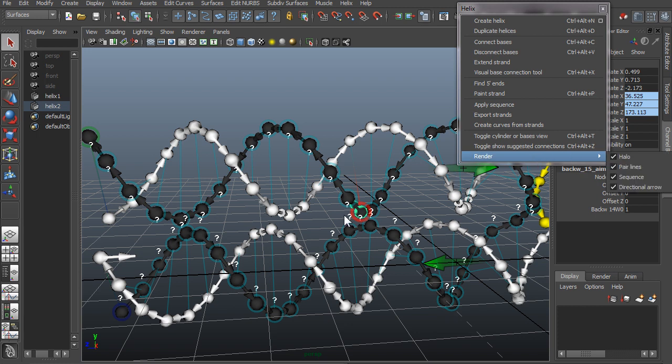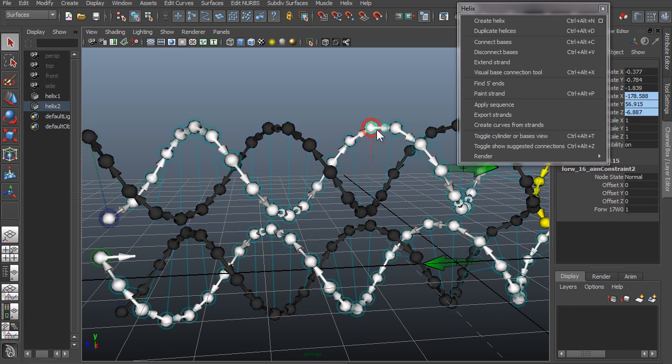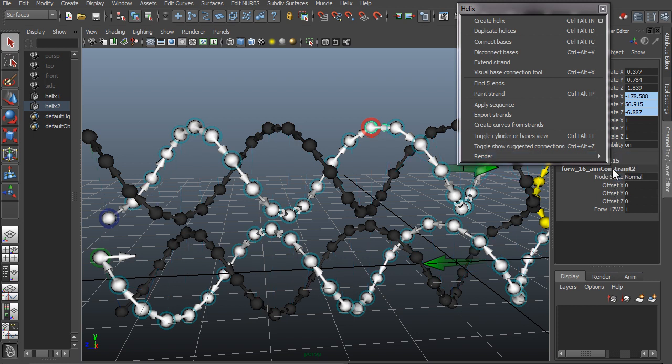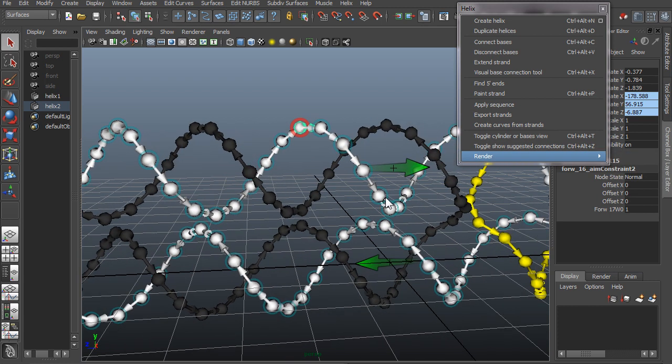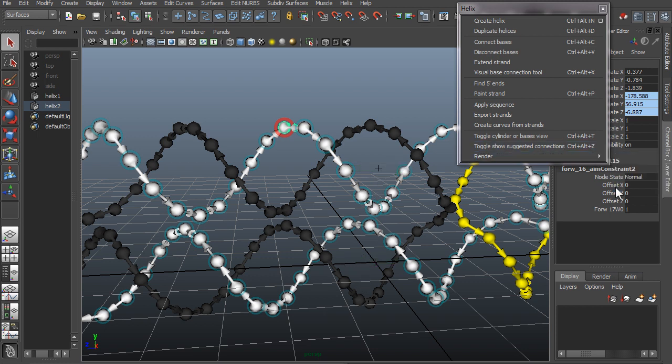Also these question marks, they're actually the sequence, so if I uncheck that we won't see the question marks anymore. And these connection lines here you can also turn those off. And these directional arrows that I was talking about can also be turned off here or on.